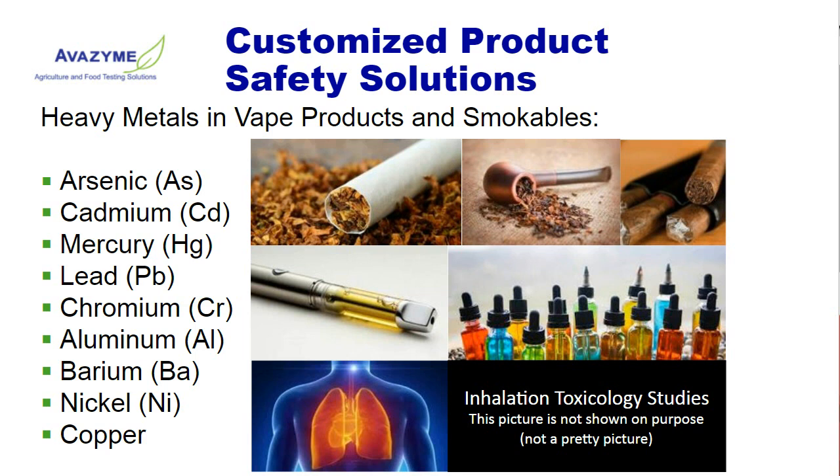You can use ICP-MS, for example, to determine heavy metals in the body by investigating hair. We can also examine human tissue samples for heavy metals content, and this is frequently done in forensics when there is a suspicion that a heavy metal, in particular arsenic or lead poisoning, may be responsible for certain observed toxicological effects.